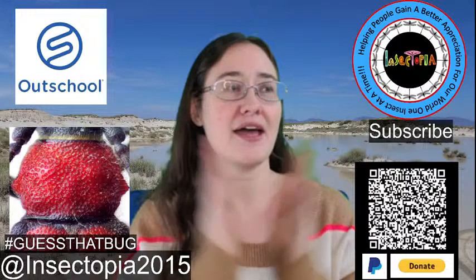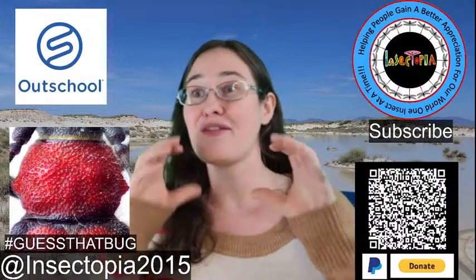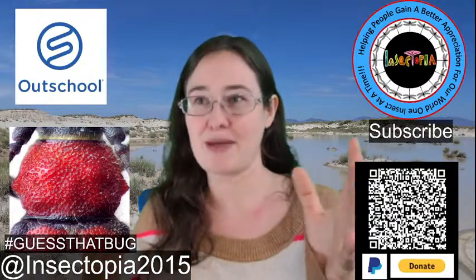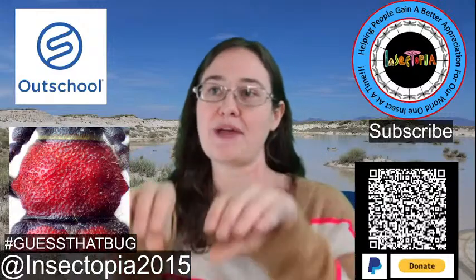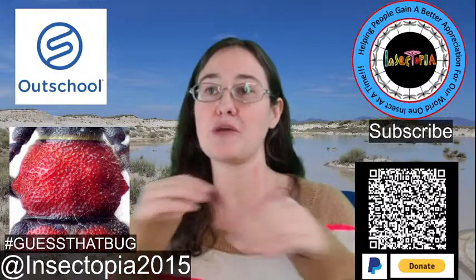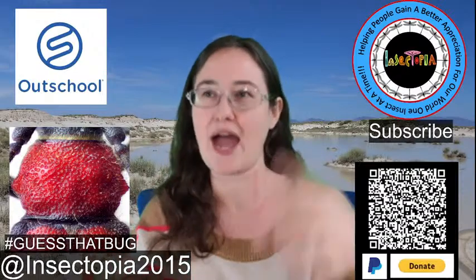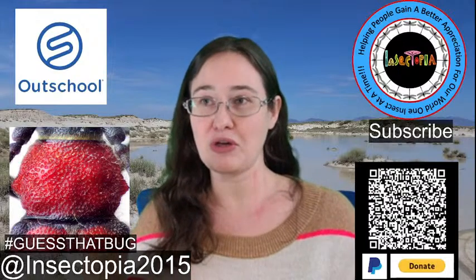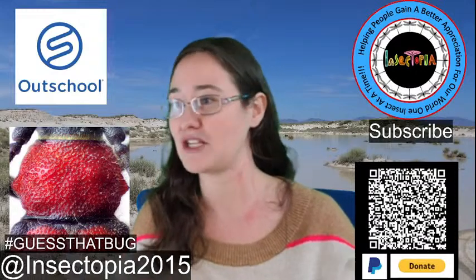And I can leave them in a paper triangle, and I'll then put the triangle into another plastic bag. Especially on longer trips. If I'm going on a 5-week trip and I need the specimens to still be nice when I get home, I'll put the triangles into a plastic bag, and then I'll put a little bit more alcohol on a paper towel and put it in the bag with it to keep them hydrated. It's always better to pin the specimen right away, but if you don't have the opportunity, that's one way to do it.